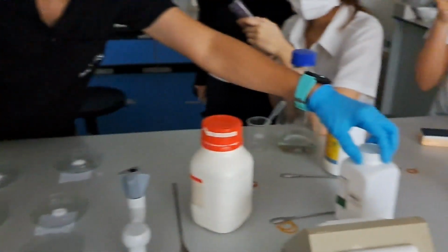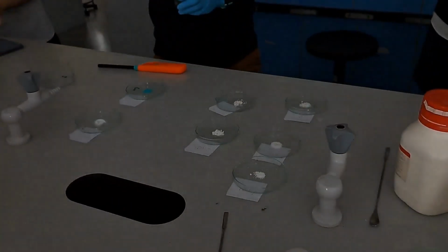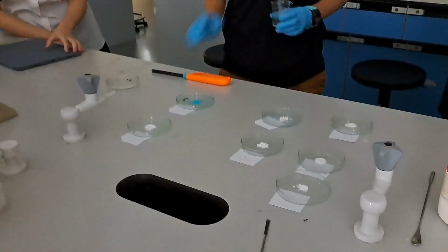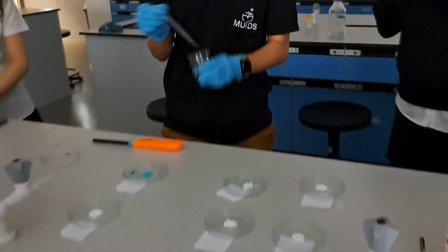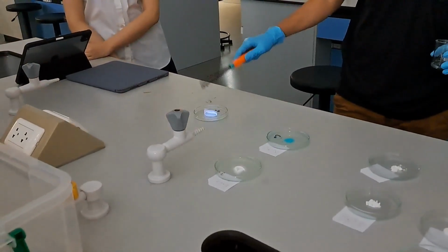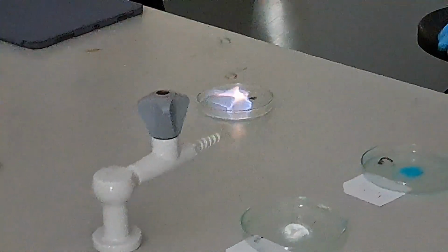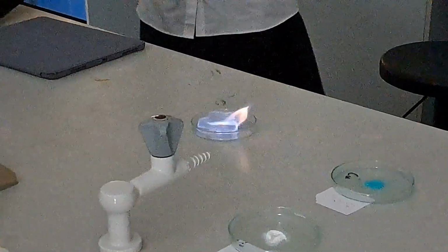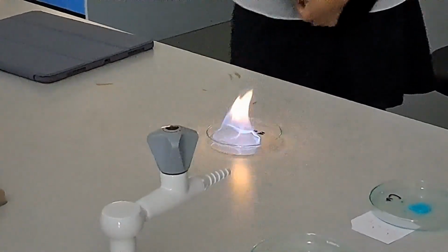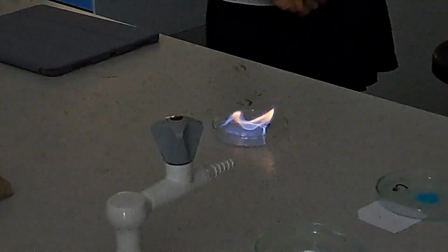Right, two more. You can put the camera down. Let's start off with the fuel. So this is ethanol. If you see this color, it is from ethanol. What do you see? Blue at the base, right? But toward the tip, it has an orange, yellow, faint yellow color. The blue one is hotter, yes.